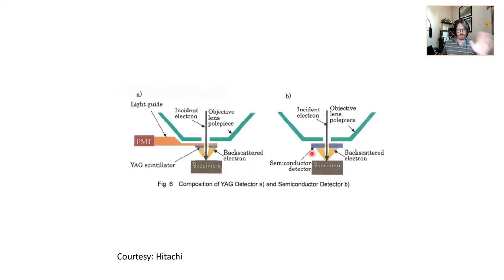Anyway, very similar, two different flavors. This is more desirable than this in a lot of cases. And I had a microscopy class where we actually did a head-to-head because I had it beat into me that these were only good for very smooth specimens, polished like a metallographic specimen. But we actually had a head-to-head comparison in a different class that I teach on electron microscopy and showed that we actually get good topographical information as well off of a YAG scintillator PMT-based backscatter detector.